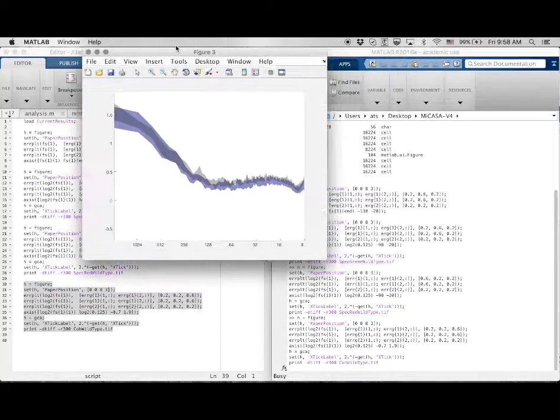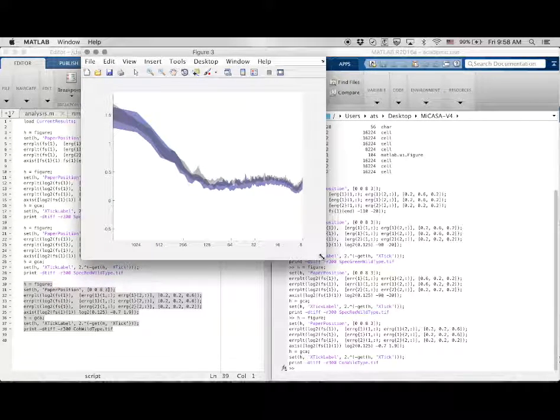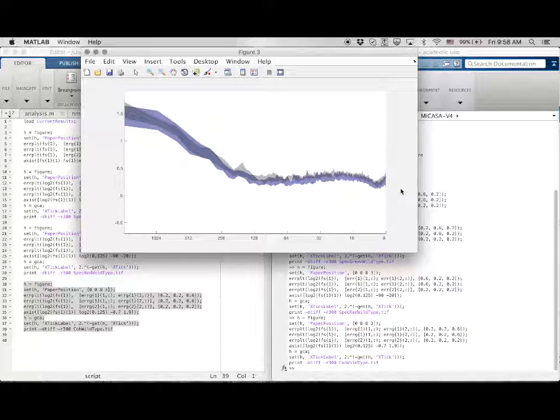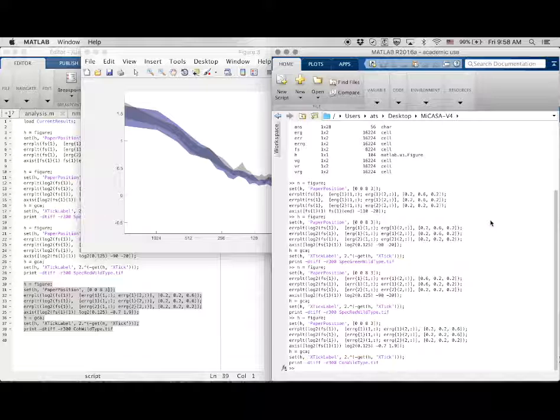And the coherences lie on top of each other. So these results are telling us that the spatial structure of one control and the other control data set are, from the distributional sense, identical, and even the relationships between the red and the green fluorophores are identical, as shown in this coherence.